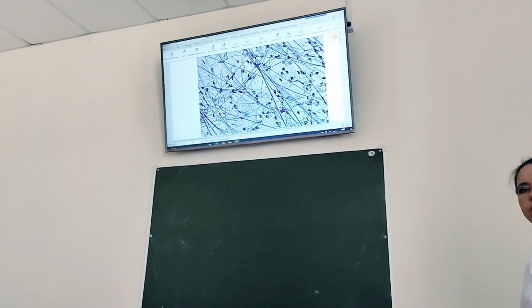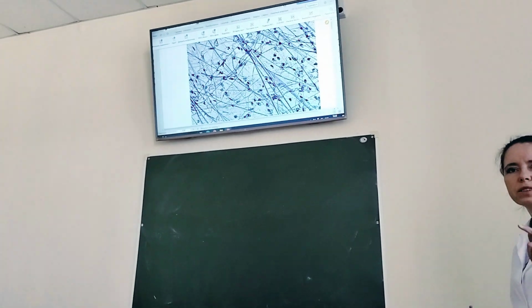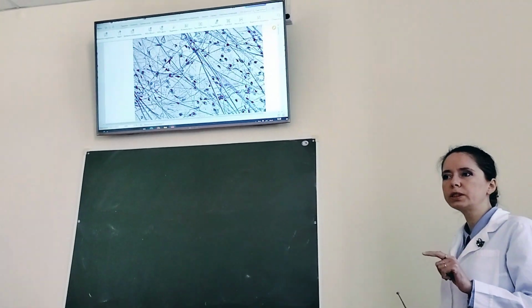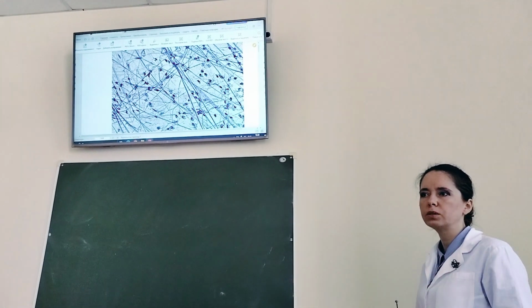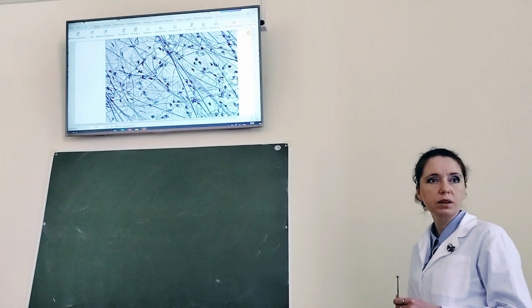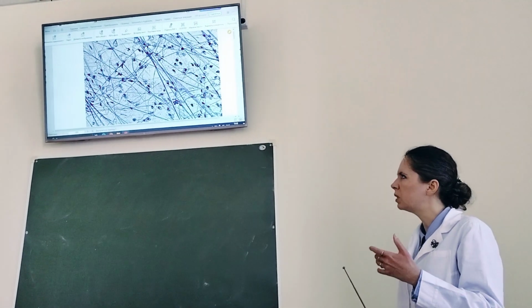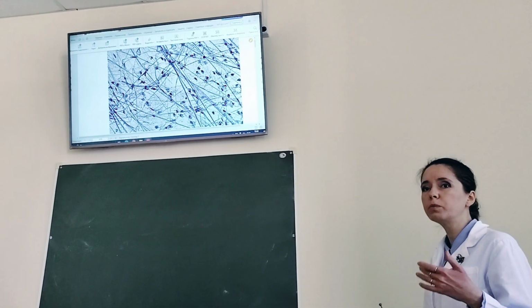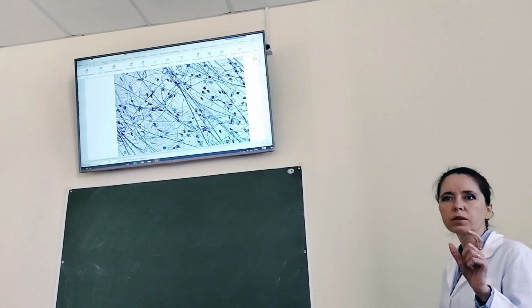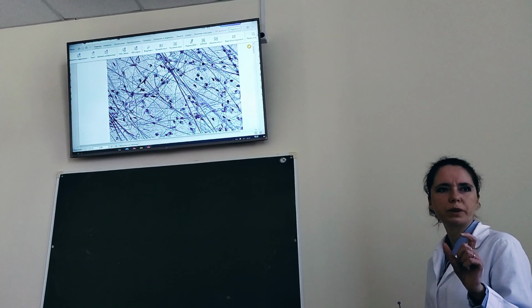Classification: loose fibrous connective tissue taken from the subcutaneous layer of the skin. You also need to describe the stain. Iron hematoxylin. Yes, if you see a dark blue color, this is iron hematoxylin. Now your brief description, which includes only major morphological properties.